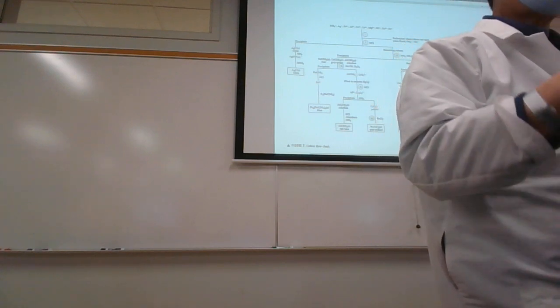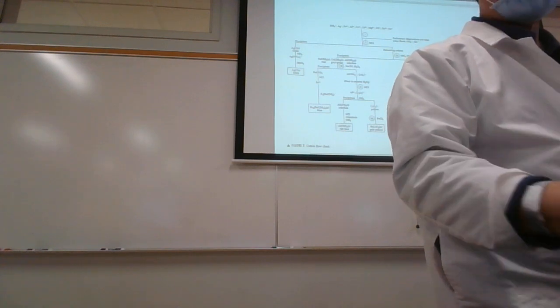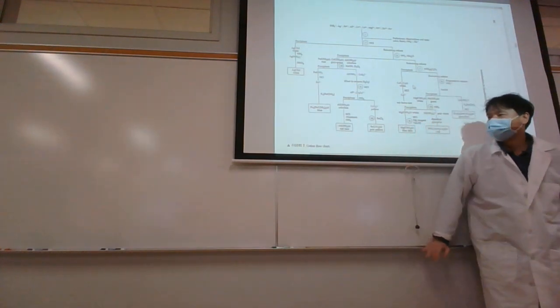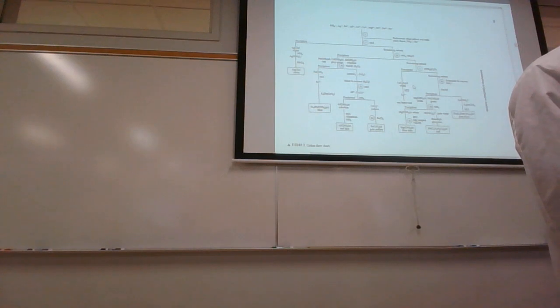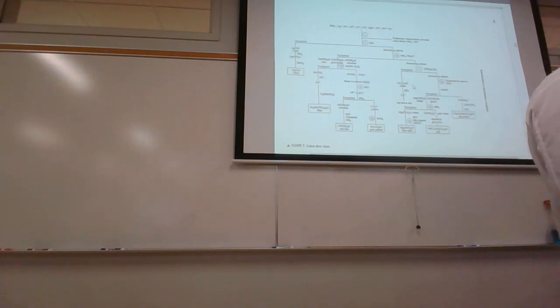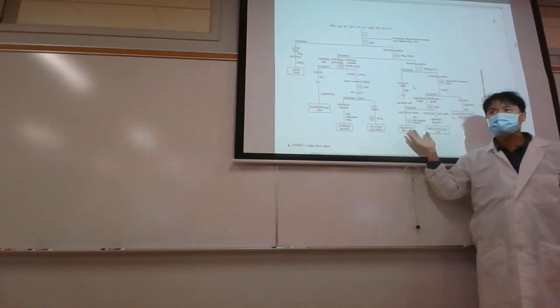So what we're going to do is use 10 drops of our unknown, and then we're going to have to change how we do the procedure. You cannot cookbook this so well. You could cookbook this if everything were written perfectly for your sample, but it's not. This is just a general one-size-fits-all. Like if you go and buy a one-size-fits-all pair of pants, are they going to fit you properly? No. And so the same thing here.